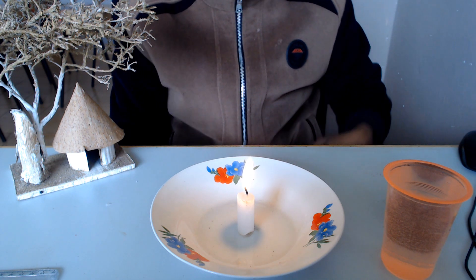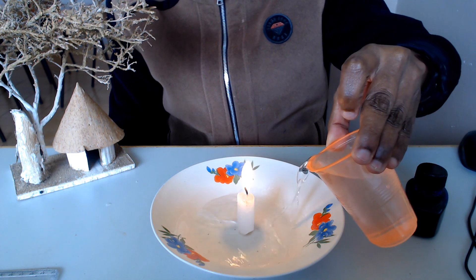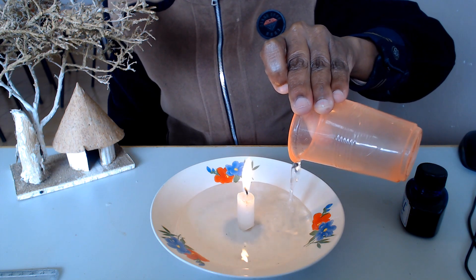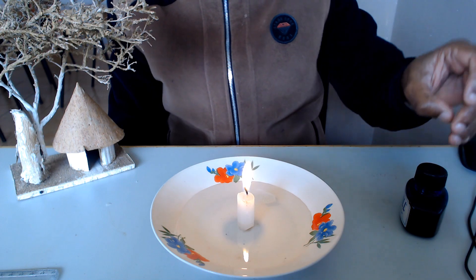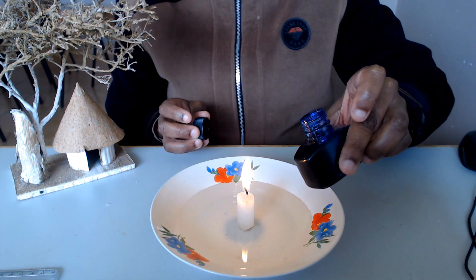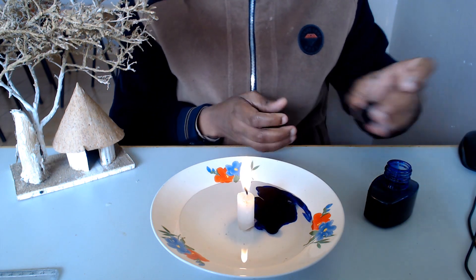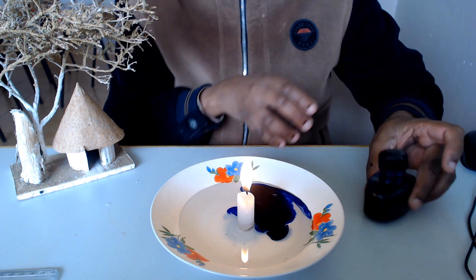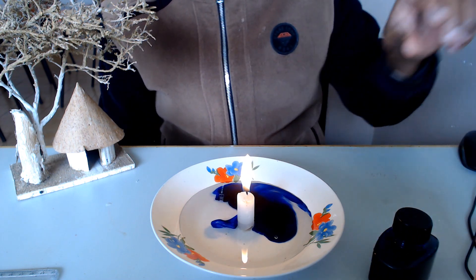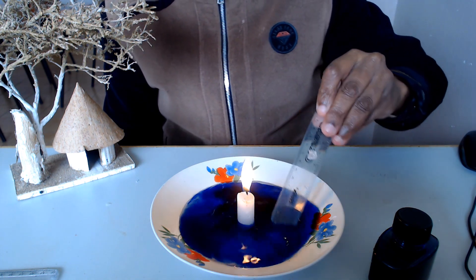The second step is to add some water into the plate, but not a lot of it. Then, because the water is not very visible, I make it visible by using some ink. I pour some ink. This ink is just to make the water visible — otherwise the experiment can work without the ink. But just because I want you to see clearly what is happening, I add some ink to make it visible. I stir the ink.